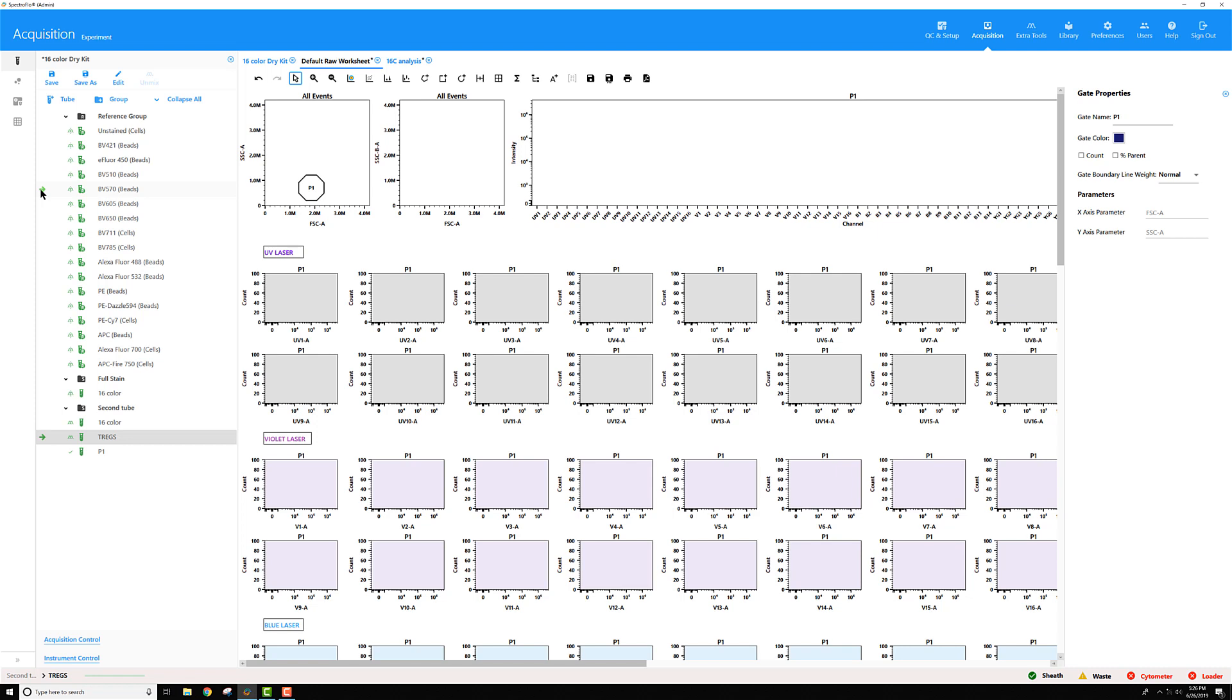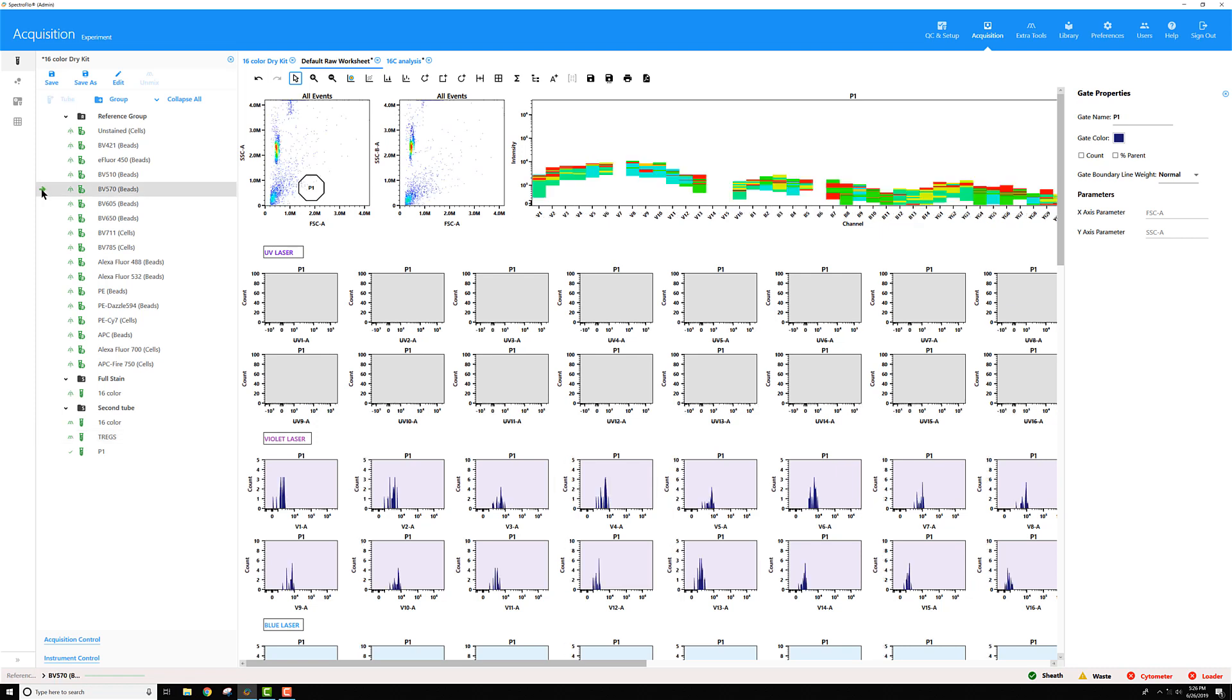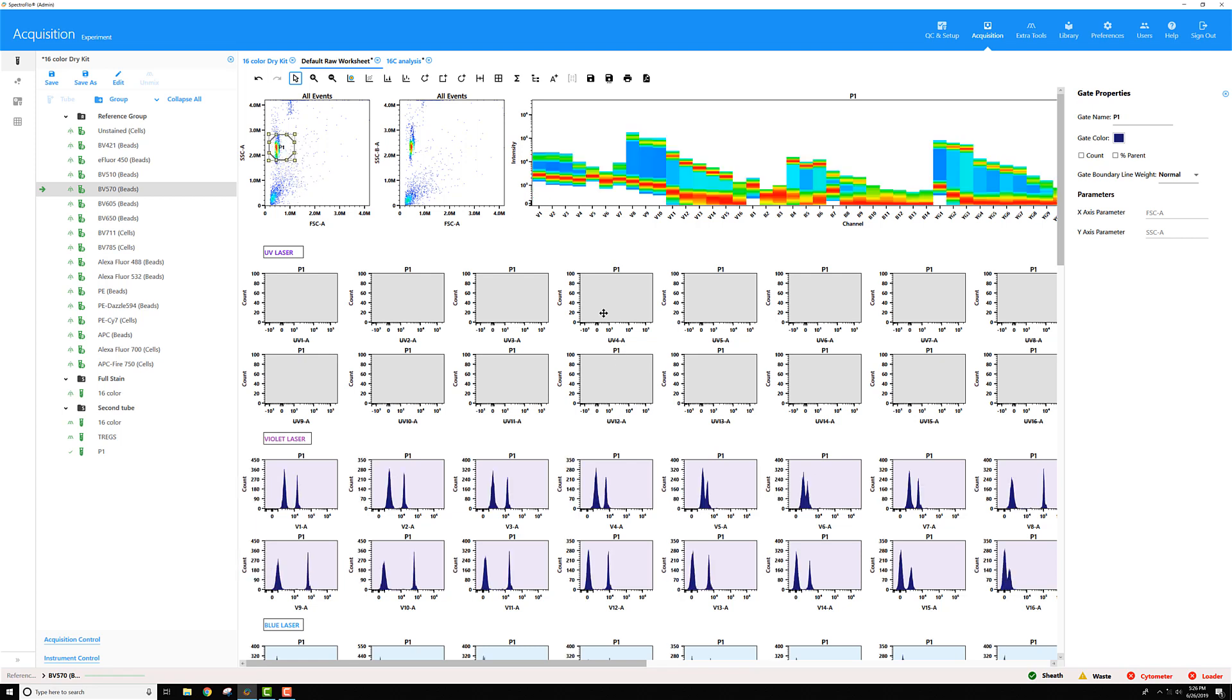You can record that data file and then do whatever gating scheme you need to, to get to your positive raw events, then right click on that gate for your positives, export it as an FCS file, and then you can import it into your reference group for whatever tube you want that to serve the control for.